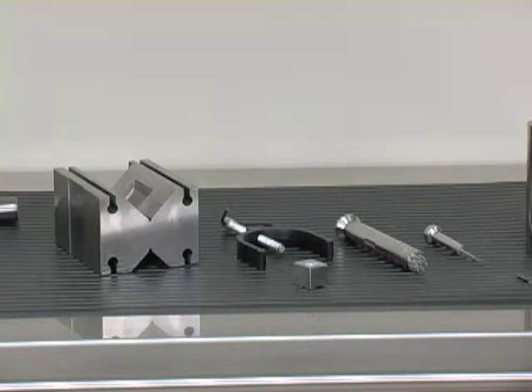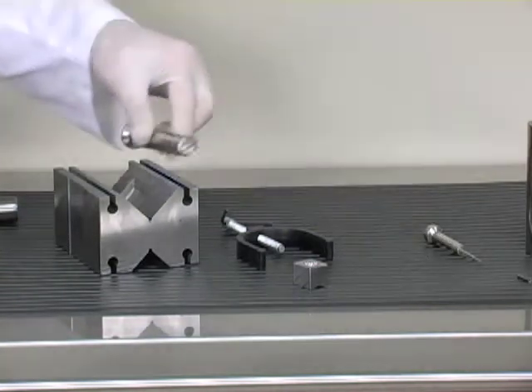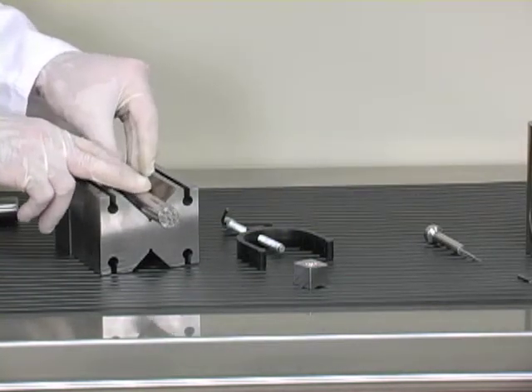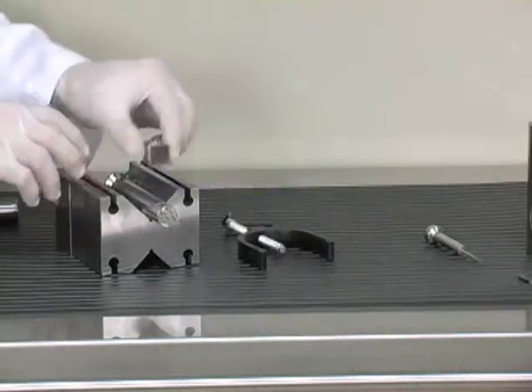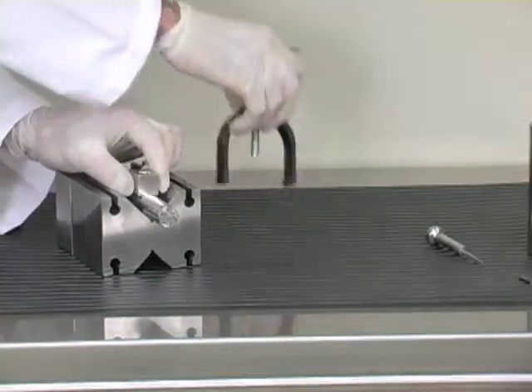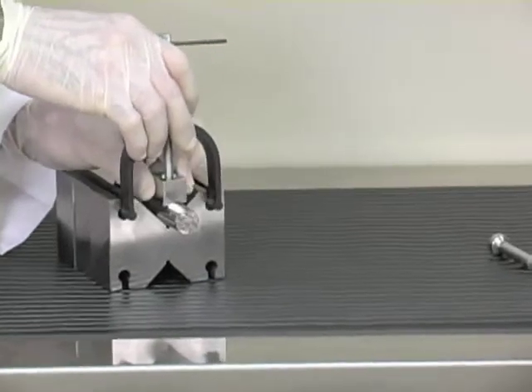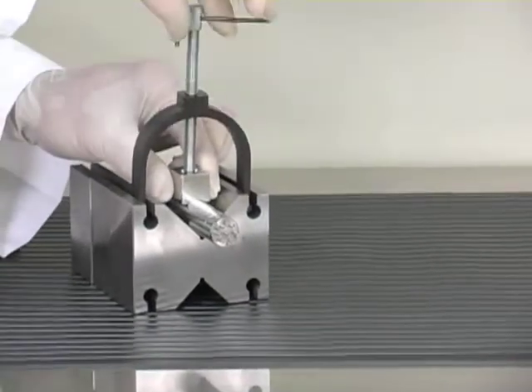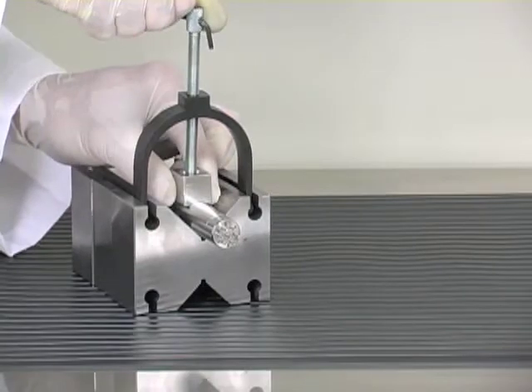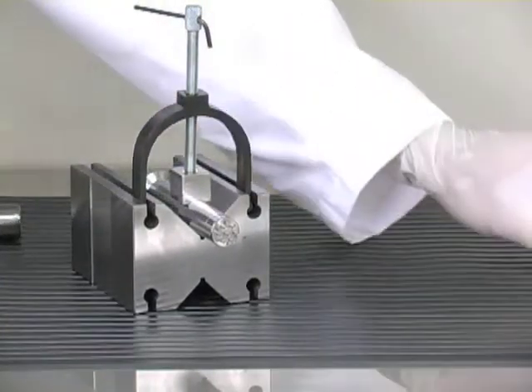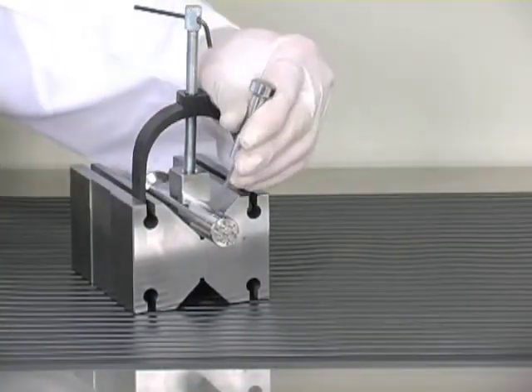First thing we're going to do is secure the punch in the v-block with the holding block and the clamp. We'll use the pen driver to remove the pen.